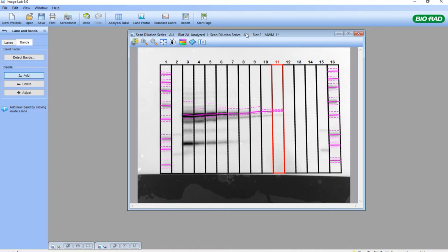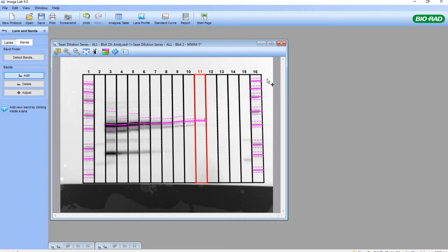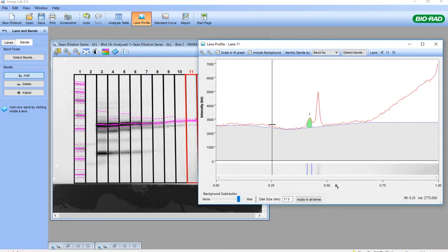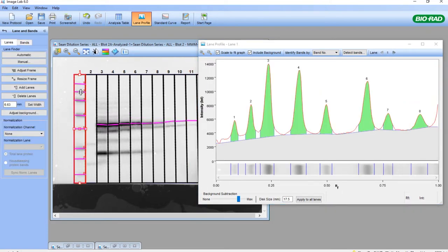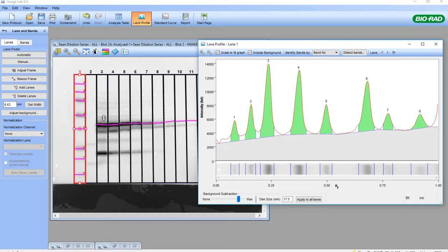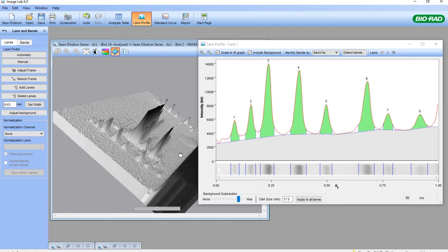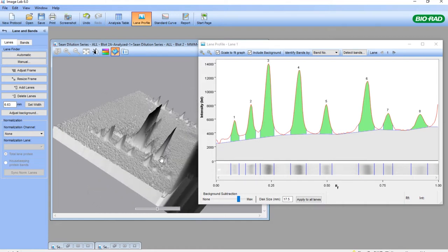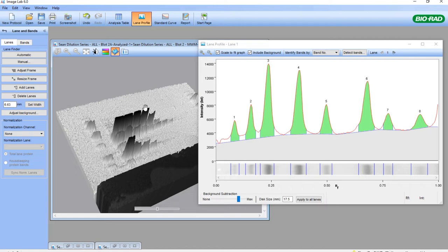I'm going to click on the bands of interest as well, then shift my image over to the left side of the analysis window and click on the Lane Profile Tool. The Lane Profile Tool permits me to select the correct width of each band. I'll click on the Lane tab and into Lane 1, which is the Marker Lane. We can select the peak of density that rises and falls over each band. If I click on the 3D tool, we can see that each band is at a particular density rising out of the background, and we're trying to assure that we select this peak correctly so the software applies a band right in the middle of each peak for molecular weight analysis.